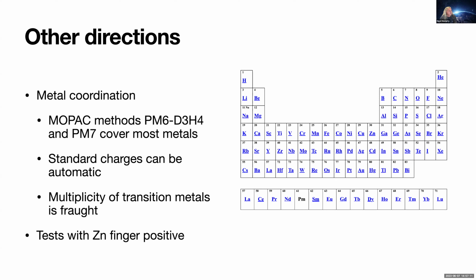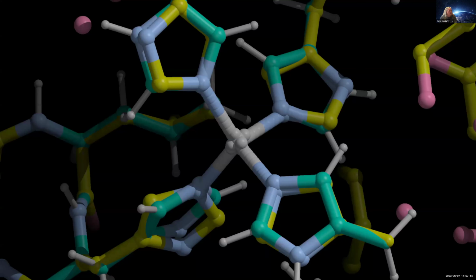I have asked John questions about this, because I've done calculations with zinc in particular, but I've had another collaborator who is very interested in some nickel ligands that contain nickel in a heme-like ring, and we've been trying to calculate good geometries and fit those geometries to the density. This particular example of the zinc compares very, very well to the actual results.